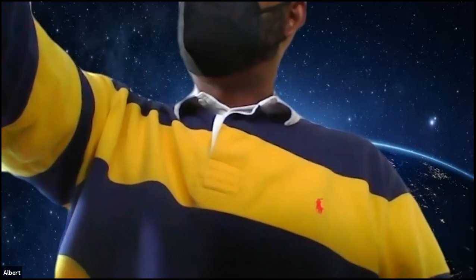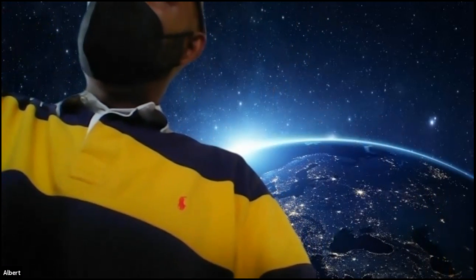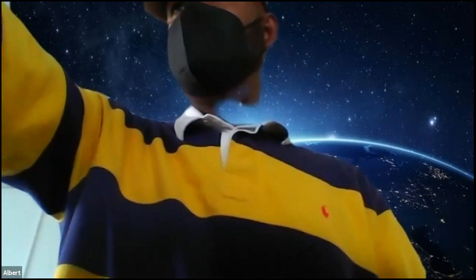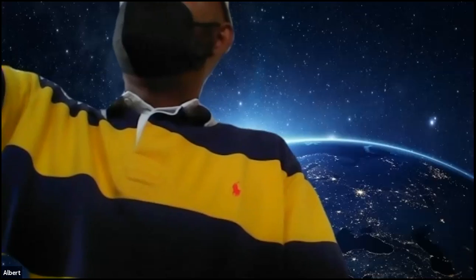All right, let me see what you got. Add a little more. Is it a slurry or is it still solid? You can put that on the hot plate now and start swirling it. Just sit it down and swirl it, yep. And keep your ethanol close by because you may have to add more. And you can sit the ethanol in the corner of the hot plate to keep it hot.